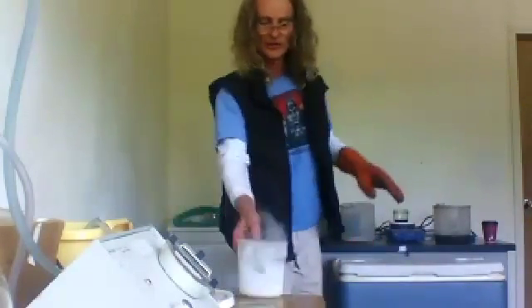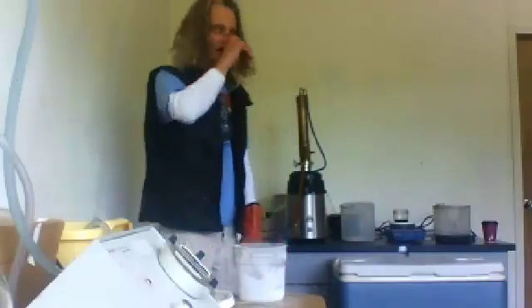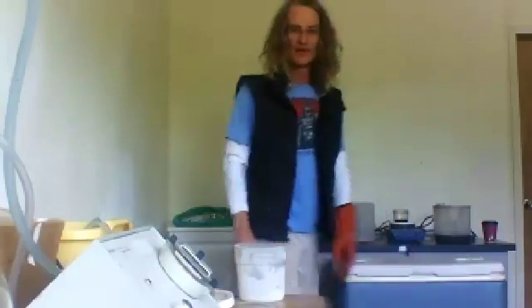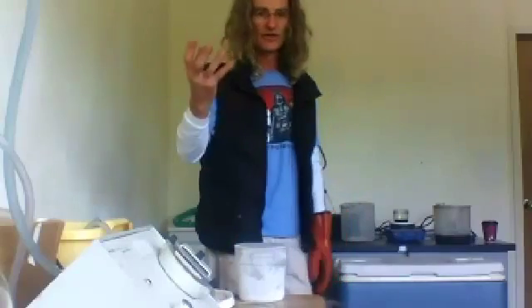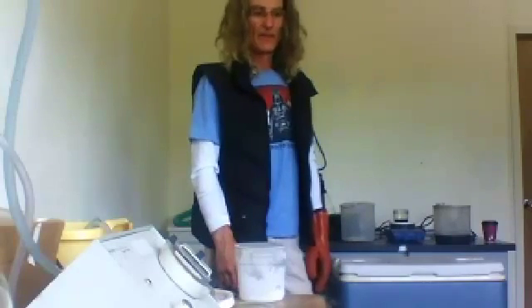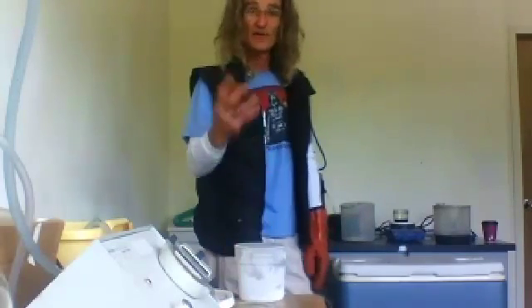Okay, we've got another box just cooling down there, and what we're going to do is some winterization really quickly, just to show you temperature locks up plant material. And it's very important to know that sometimes you can use your plant material in there as a filter, a very efficient filter.